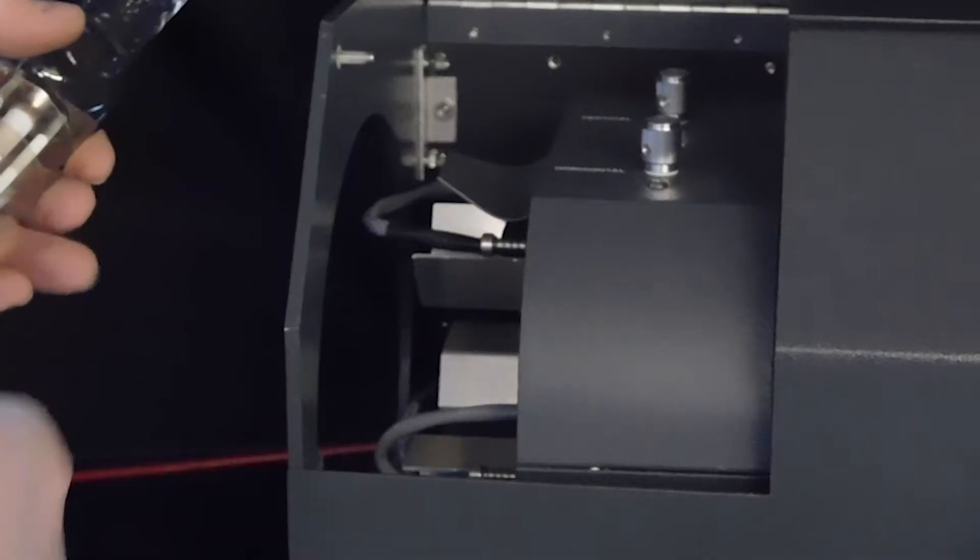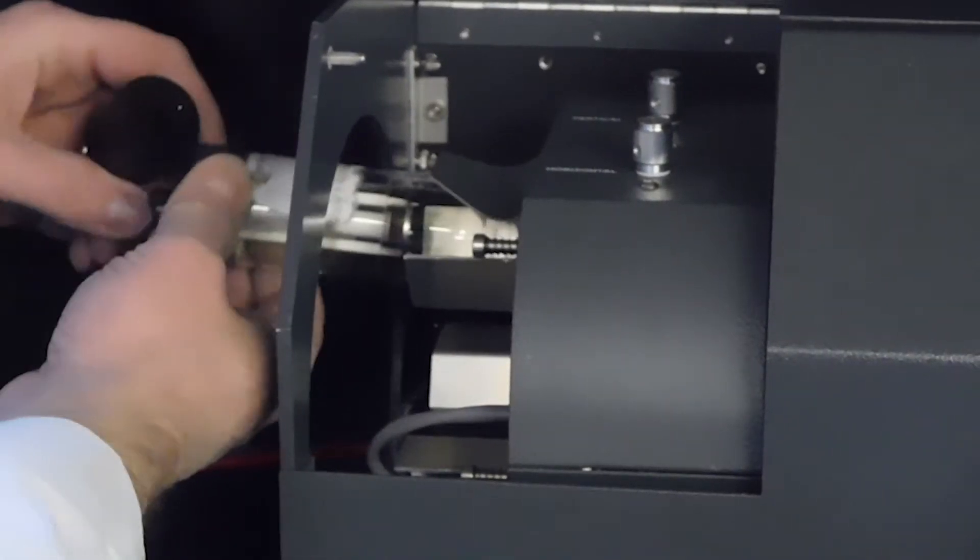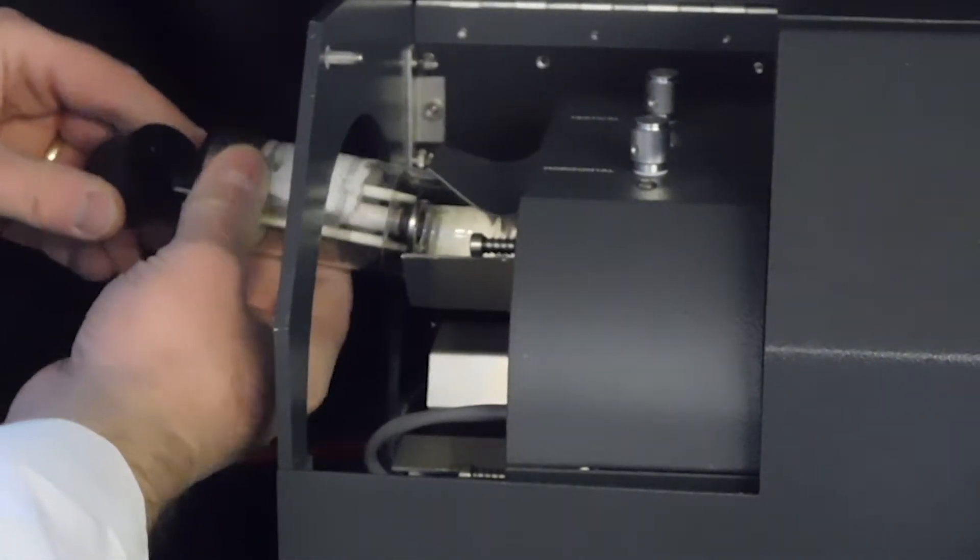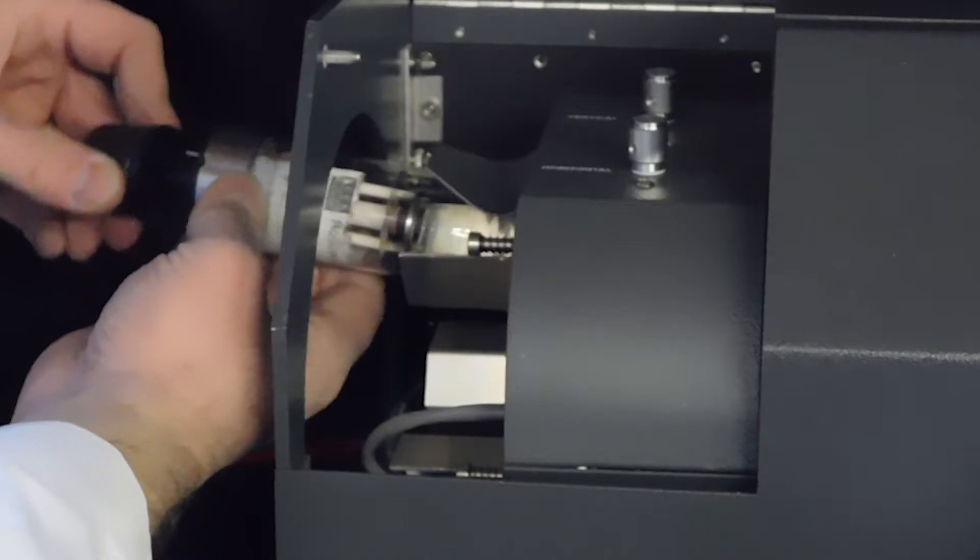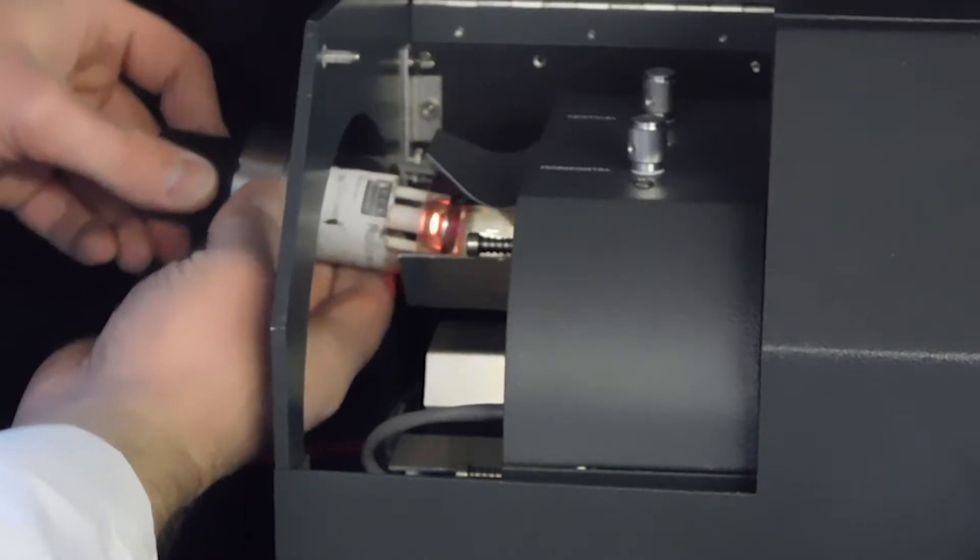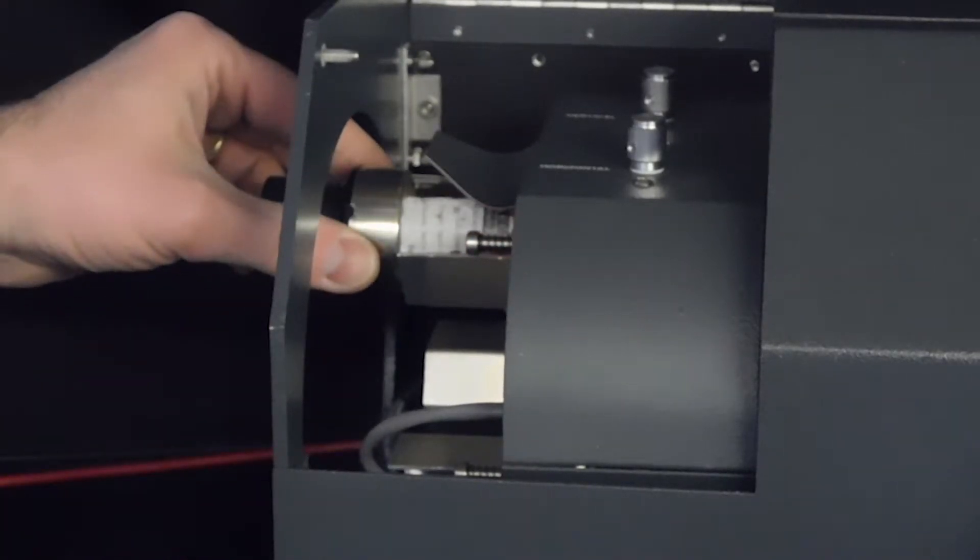At this point you'll insert your hollow cathode lamp fully into the holder.